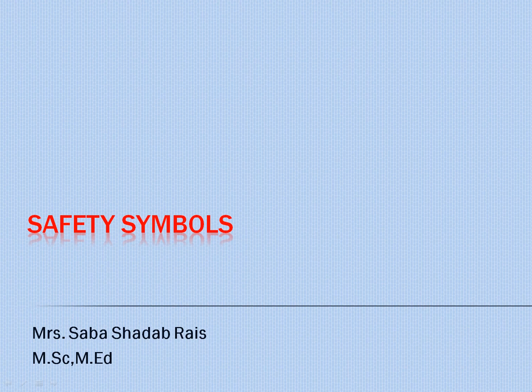Before entering the lab, I gave you 19 rules in the last video that you all have to remember. Students, a laboratory can be a very hazardous place if not taken care of properly. So before entering the laboratory, you must be sure. In this lecture, I am going to talk about safety symbols.